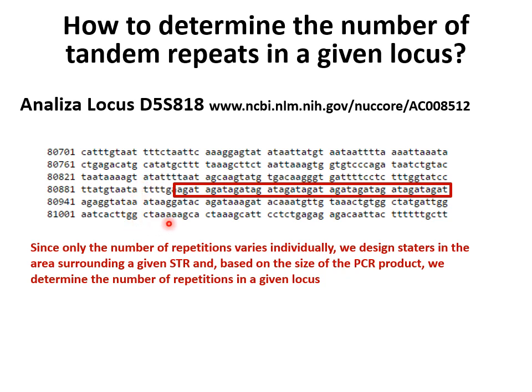So what we can do, we can design the primers, for instance, in the common area. So we can say here will be the forward, and we can design the reverse. Maybe let's take another color, and we can design, for instance, the reverse there.